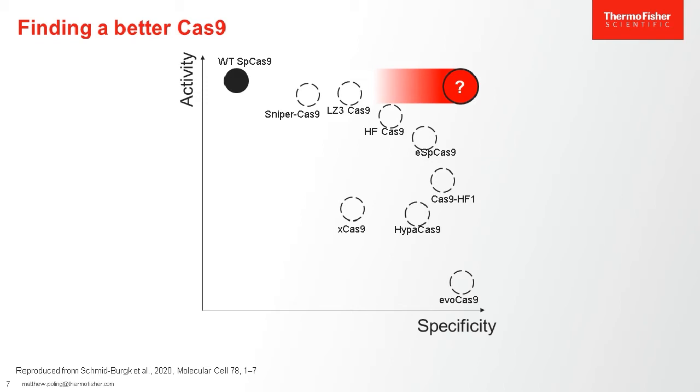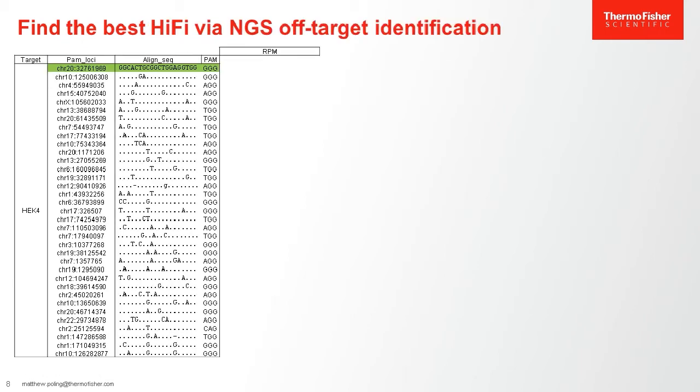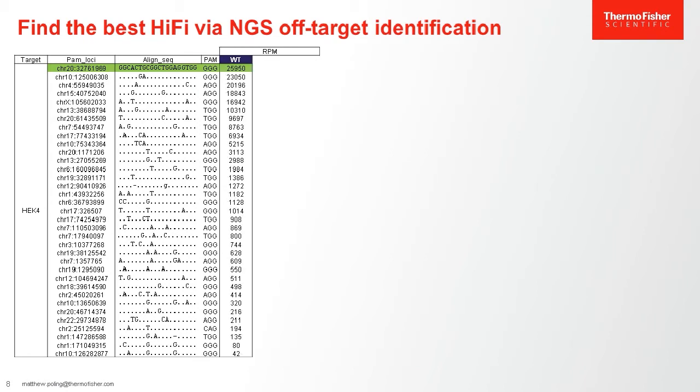And so what the team did is we looked at a number of characterized point mutations of the Cas9 enzyme, and then we screened and challenged them by NGS to try to find the best enzyme, using next-generation sequencing for off-target identification. For this, we're using a modified version of the GUIDE-seq technique that we call TEG-seq. What we're showing here is an output from those GUIDE-seq experiments. Ultimately, what we're looking at is an on-target site, the one that's highlighted in green, and all of the various off-targets that have occurred that we can identify by next-generation sequencing. When we look at our wild-type Cas9, we can see, again, really nice cleavage at that on-target site, but all of this off-target activity occurring across the genome.